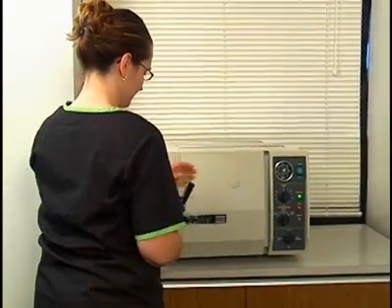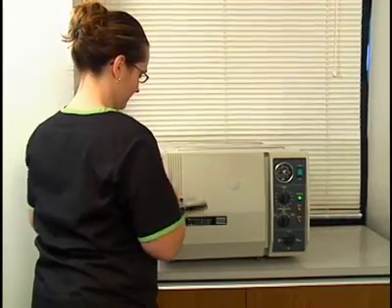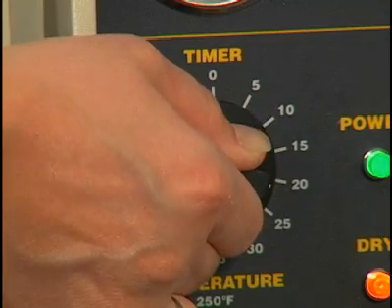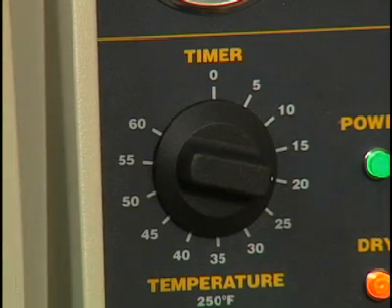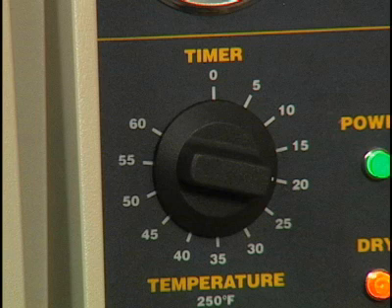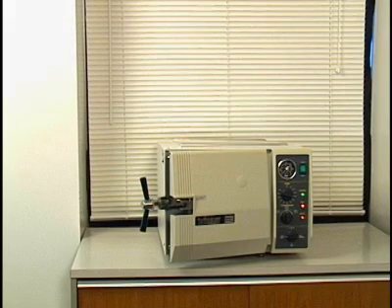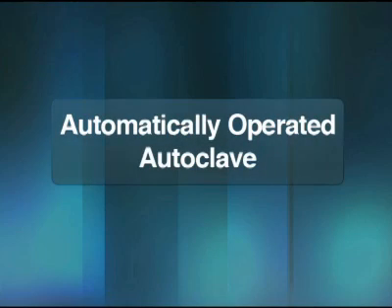Dry the load by cracking open the door approximately 1/2 inch, but not more than 1 inch. Set the drying time using the timing control. The drying time will vary between 15 and 60 minutes, depending on the autoclave and type of load. This information is indicated in your autoclave instruction manual. The packages must dry fully, otherwise microorganisms can move through the moisture on a wet wrap and contaminate the sterile article inside.